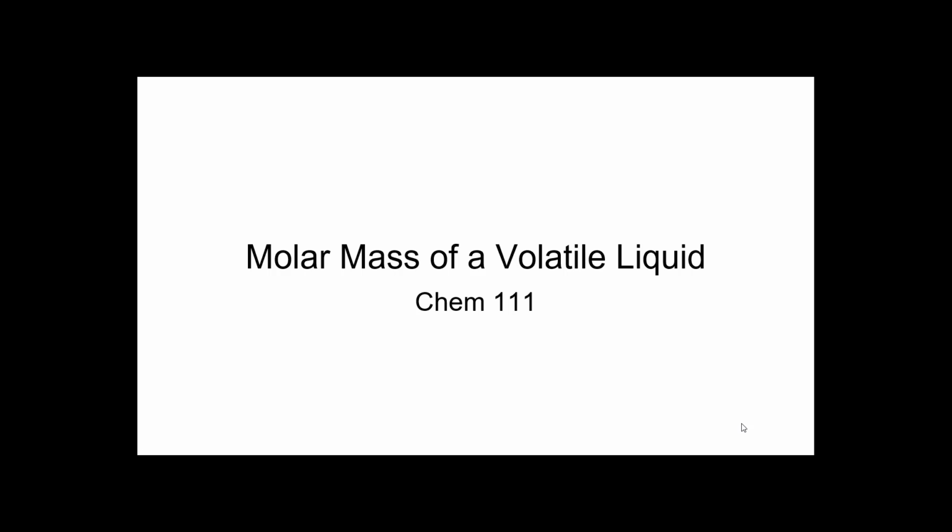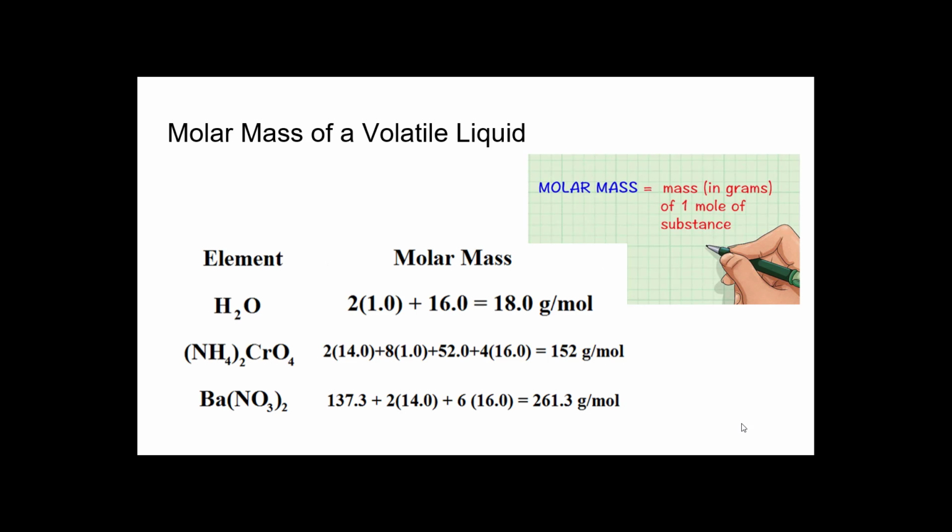Hi class, this week's lab is molar mass of a volatile liquid. And this is a pretty easy lab. I like this lab, especially when we do it in person. The downside is the lab smells like a nail salon, really concentrated from everybody's unknown compounds, but it's a really easy lab. I don't believe most of you should have problems with this lab.